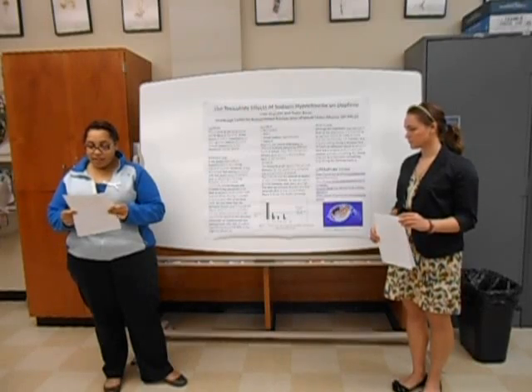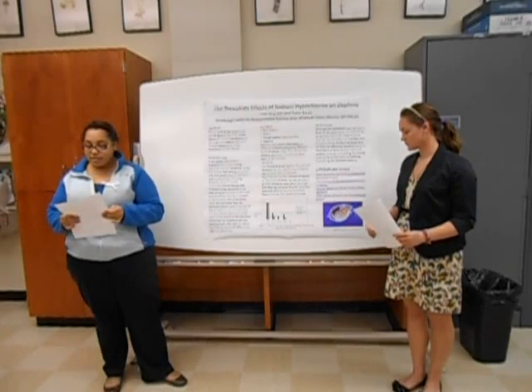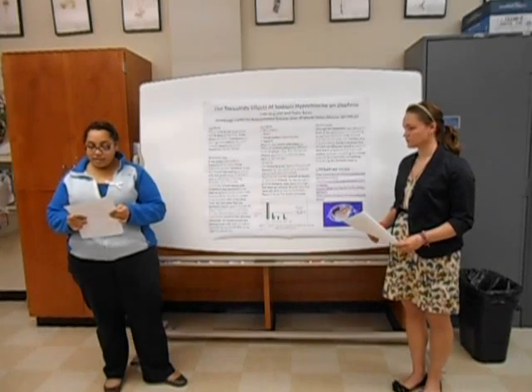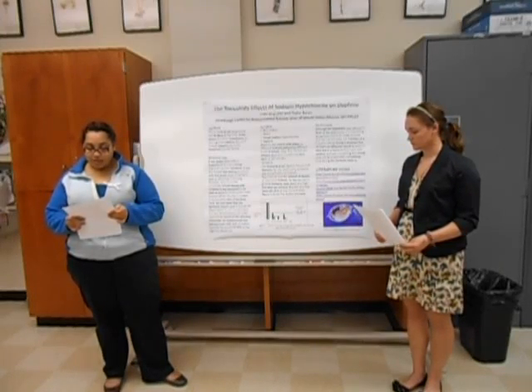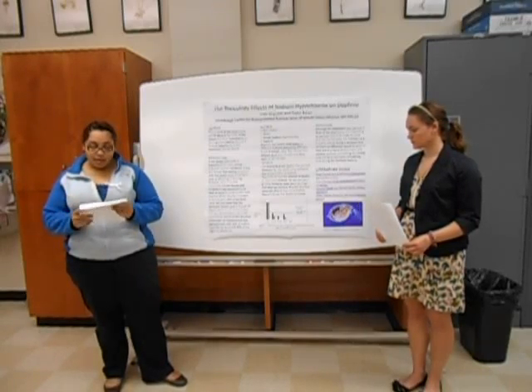As we figured out the new levels, we did our first trial again, and we used the 0% control, 0.039%, 0.042%, 0.05%, and then the initial 5% again.